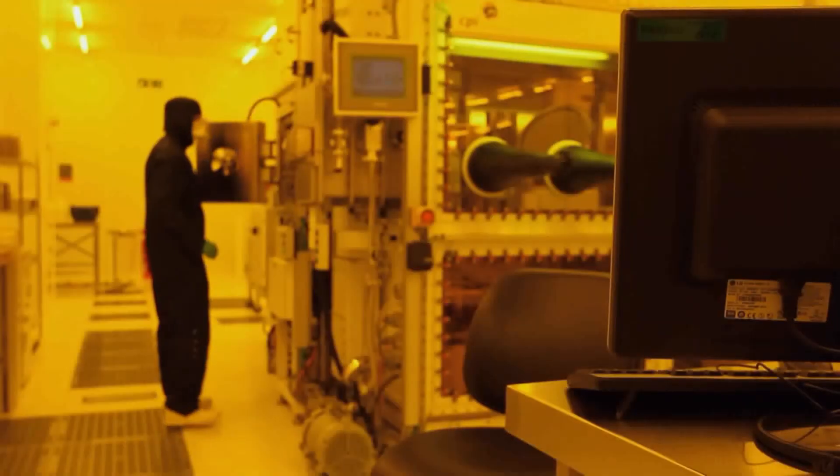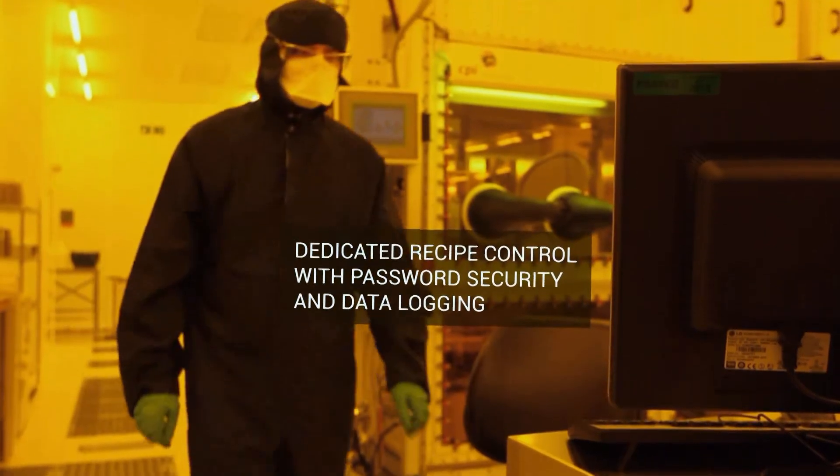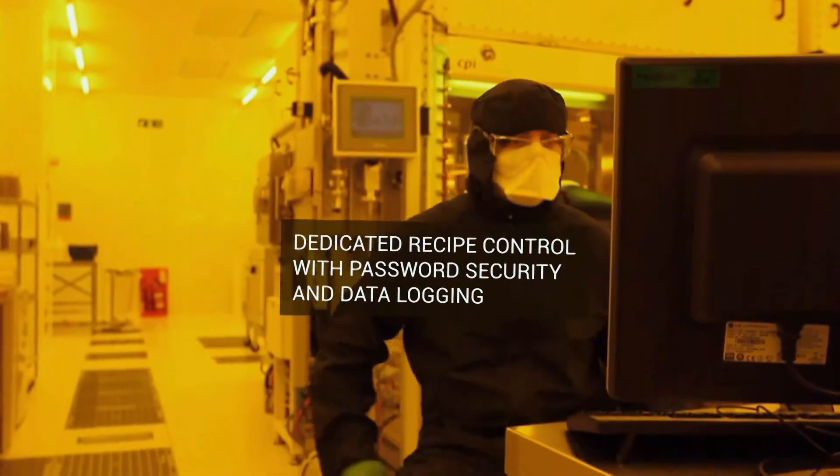The process commences by positioning the substrate cassette in the convection oven chamber. The chamber bakes the substrates, removing all traces of moisture.